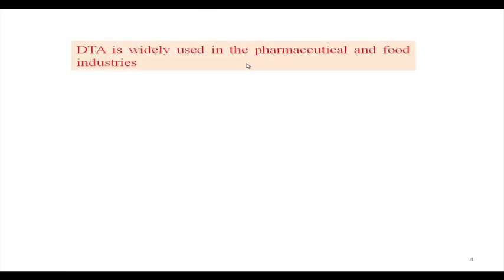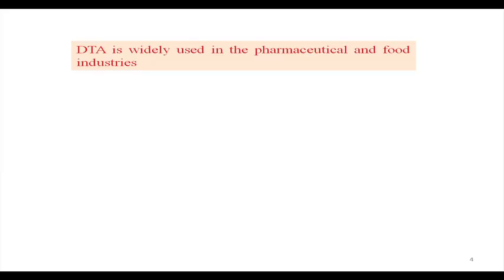Okay, welcome back to this class where we are discussing the application of your DTA technique, and we know that there are several such applications, and particularly the most important one is the use of this DTA instrument in pharmaceutical industry. So, in pharmaceutical industry, this particular technique along with the next technique what I will be talking about, the DSC, is widely used for the typical analysis of the drug, the medicine, the tablets, the capsules and all.